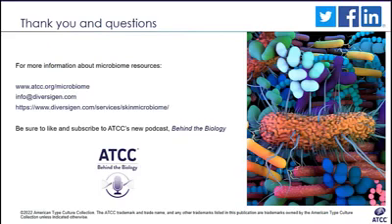I think that you covered some of this earlier, but yeah, that's a good question. In terms of the best method, I think it's going to be the one that enhances the amount of DNA from the microbes of interest. And of course, that it's consistent across different skin sites. Again, as I mentioned in the webinar, dry, oily, and moist.